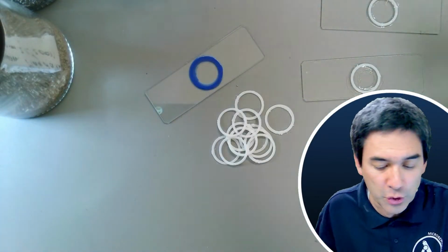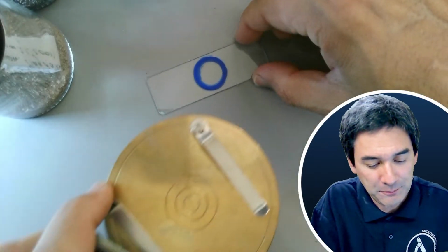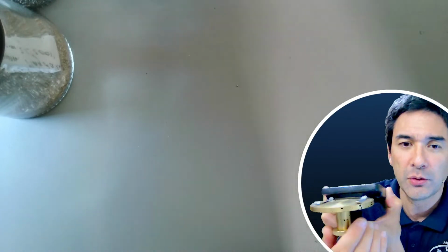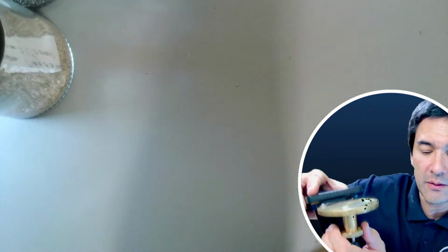Before I do that, I'm going to show you two possibilities here: the professional looking one and the improvised one. This is a so-called slide ringing table. You know what? I'm going to just show you the whole device by holding it up. This is how it looks. This bottom part is able to spin. This is a rest for your hand so that you're able to hold a brush properly.